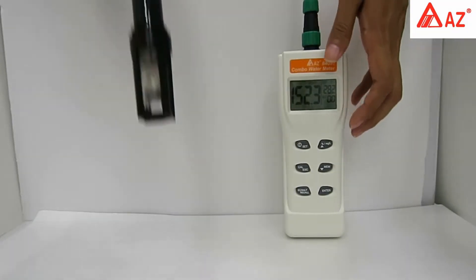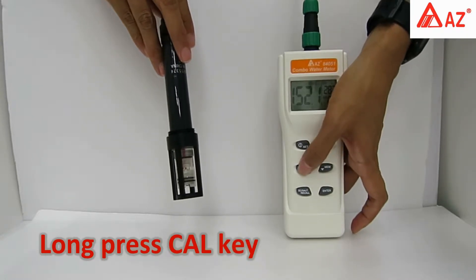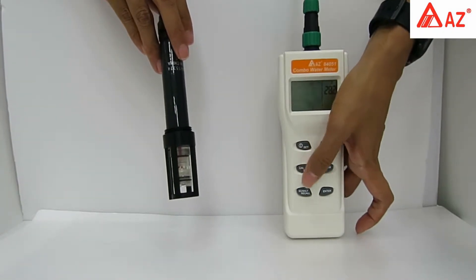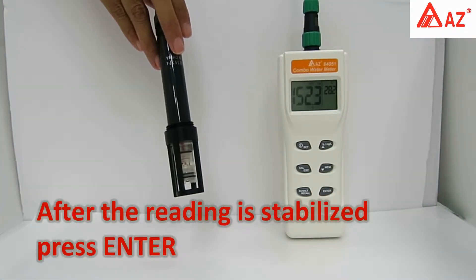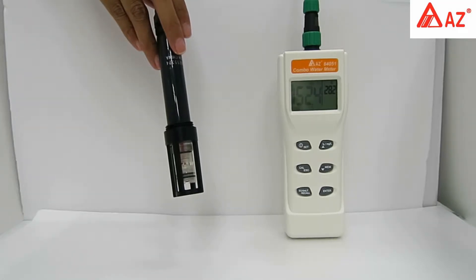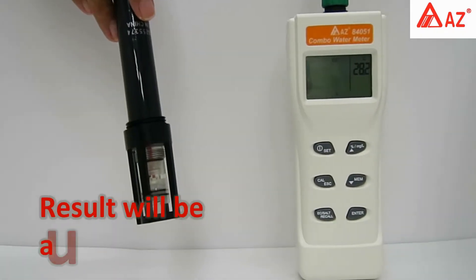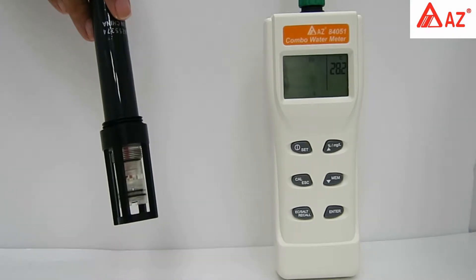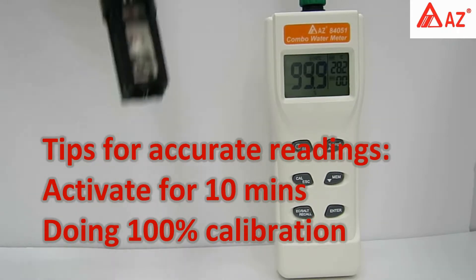Hold the DO probe in the air and long-press Cal until the Cal icon appears. After the reading is stabilized, press Enter — or wait about 30 seconds for the 'SAVE' icon to appear, when the result is automatically saved and the meter returns to measuring mode. Remember to activate the electrode for 10 minutes and perform a 100% calibration to get accurate readings.